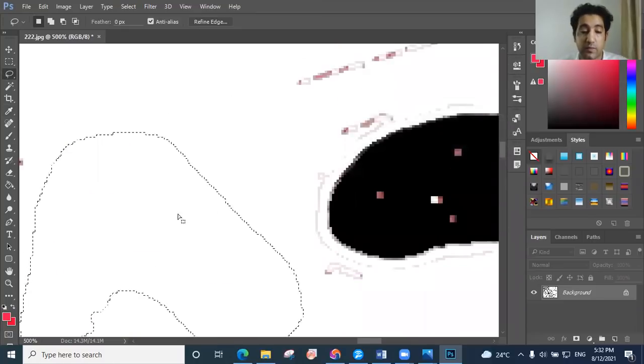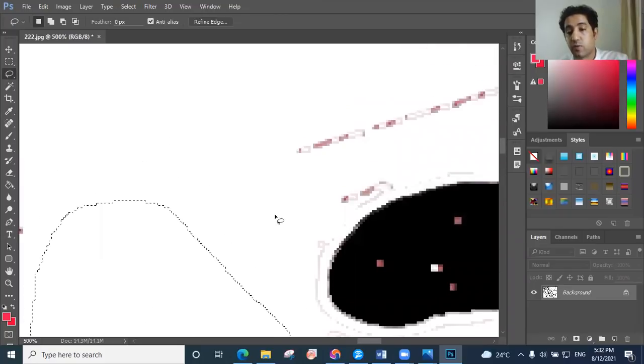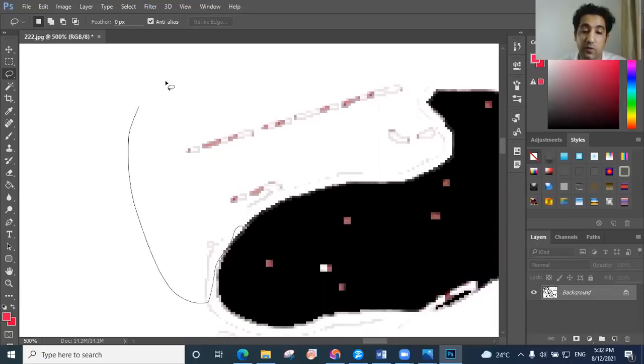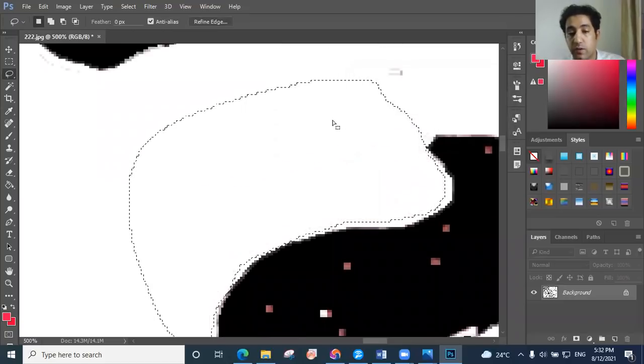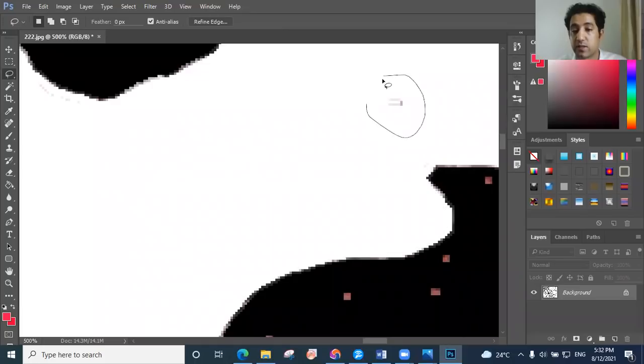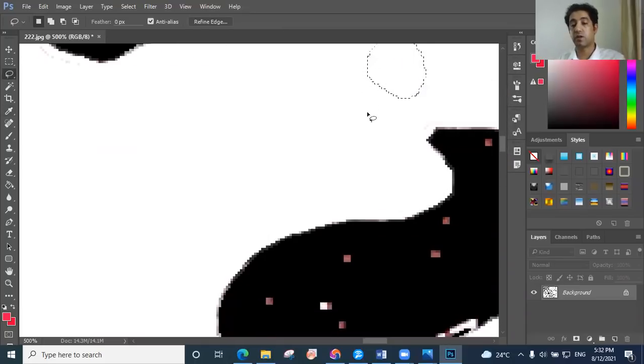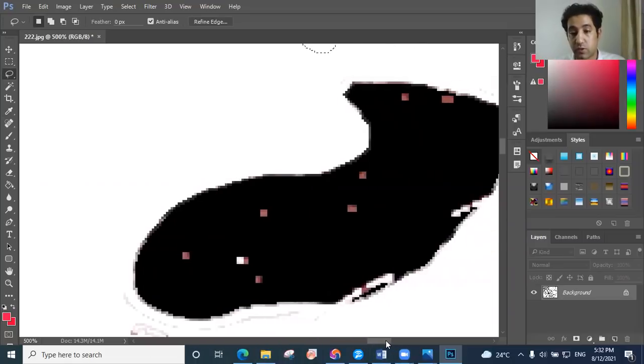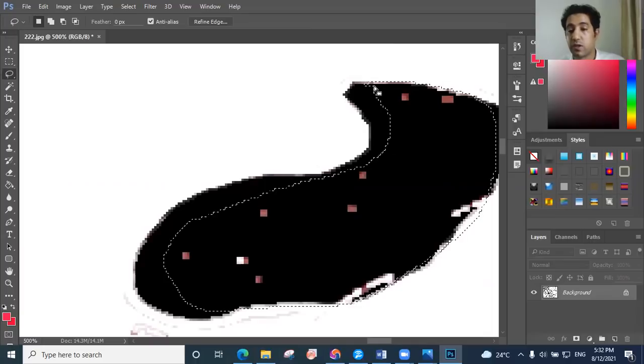Some structures, this problem will not occur. This depends on the color of the microstructure. Because my structure here is colorful, so maybe you will find this. Otherwise, if the structure is black and white, you cannot find these dots or problems. So it will be easier for you to calculate the grain size with shorter time.